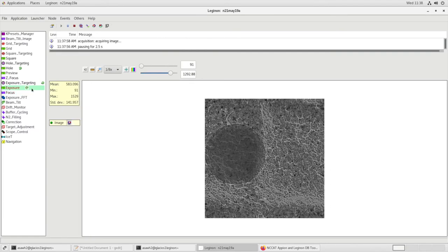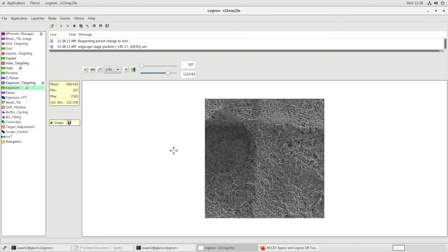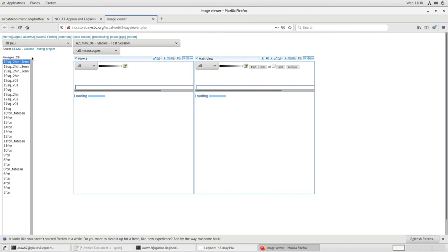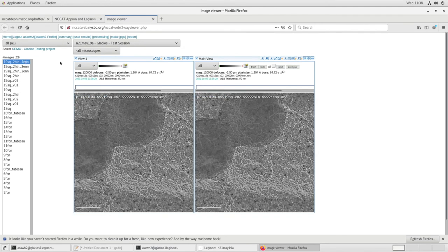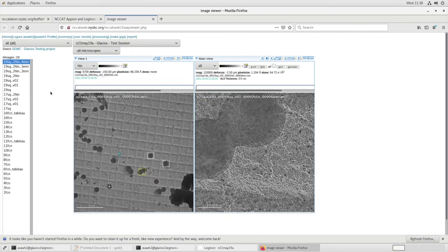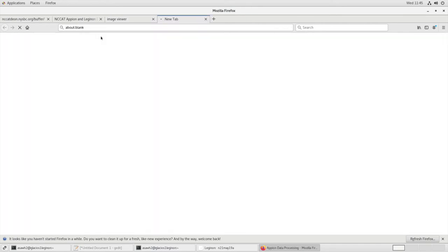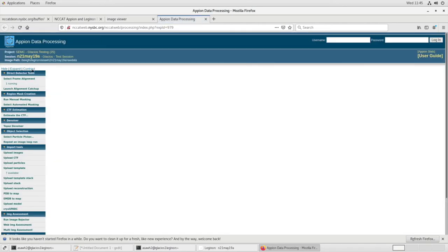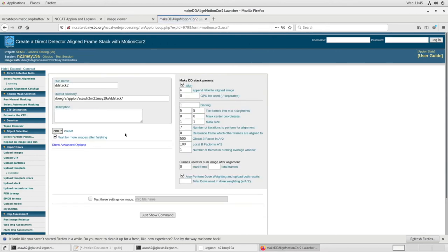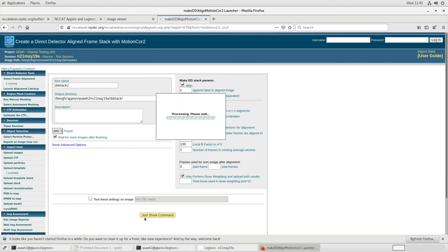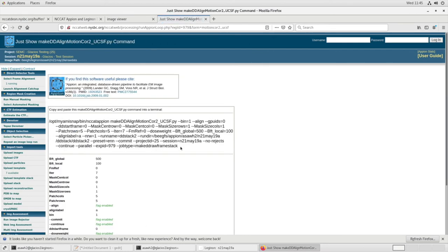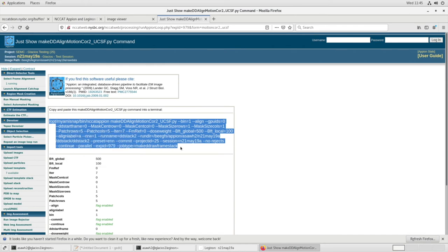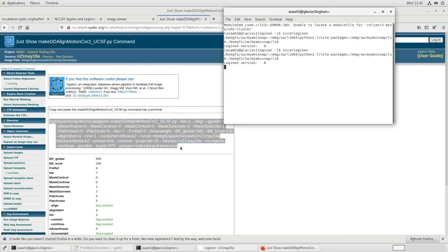In Exposure Node, these will be our exposure images. Let's go to NC-CAT, web.nysbc.org, and Two-Way Viewer. We want to set the first view at Hole, and the second view will be ENNs. Make sure the targets are aligned. Click Processing, select Frame Alignment, go to Motion Core 2, just Show Command. Let's copy this command.